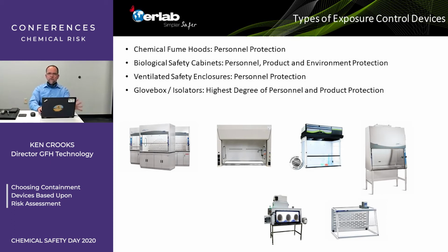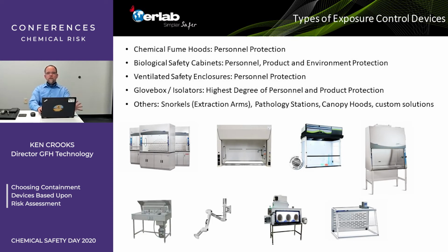And hopefully you do those transfers properly and you maintain that total isolation. And again, this gets back to the CMR and the high toxicity products we were talking about earlier. And then there's a whole host of other solutions, right?